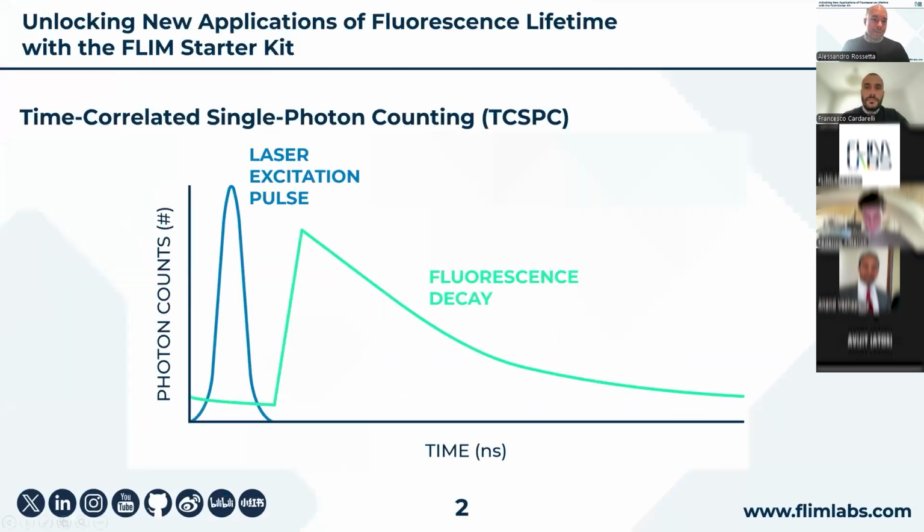To begin with, I want to spend a couple of minutes telling you that the basic principle that is the state of the art of measuring fluorescence lifetime relies on a technique called time-correlated single-photon counting.